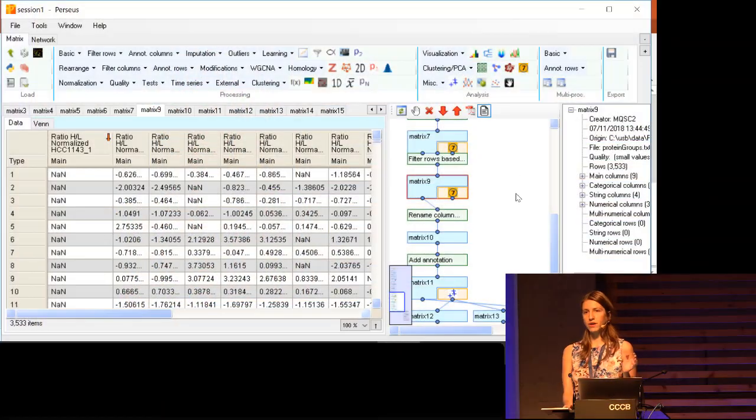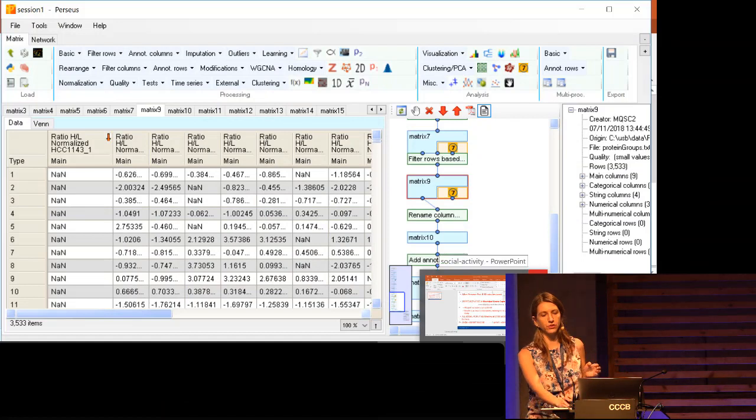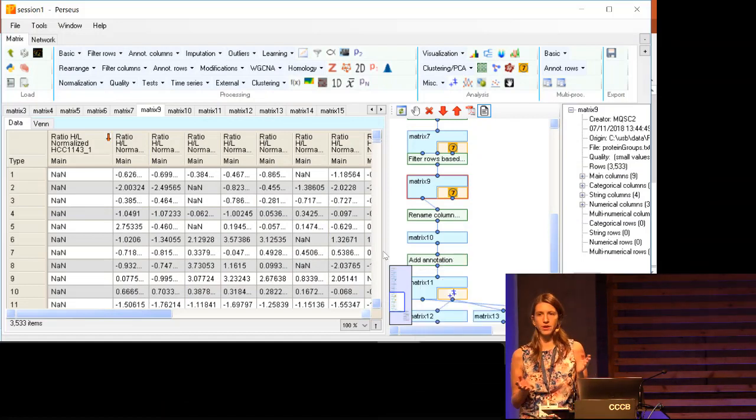So hopefully today you're learning useful statistical and data normalization and analysis tricks that will help your own research. So far, essentially what you saw is the initial data preparation part. And I would say this is really the essential part.